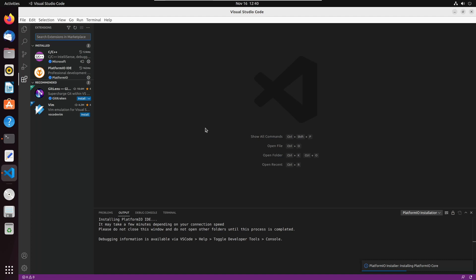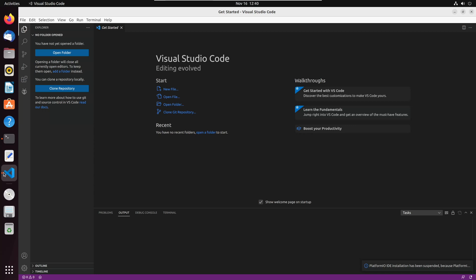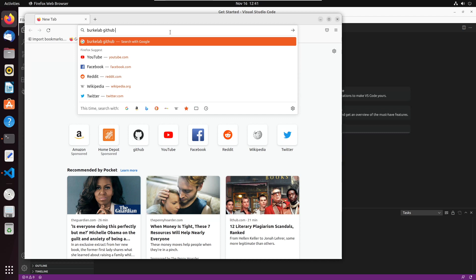On the bottom right it says PlatformIO installer installing. It's done — it says to restart. We'll reload Visual Studio Code and wait for it to come back up.